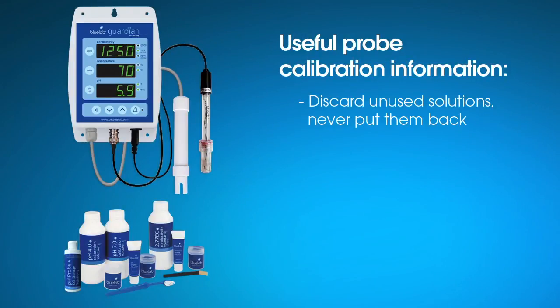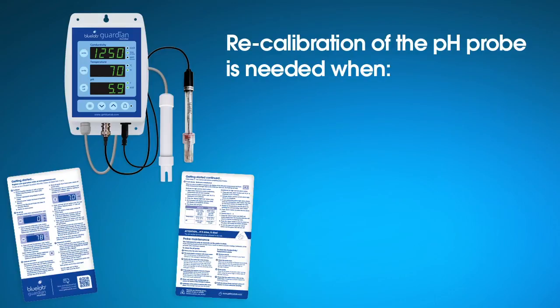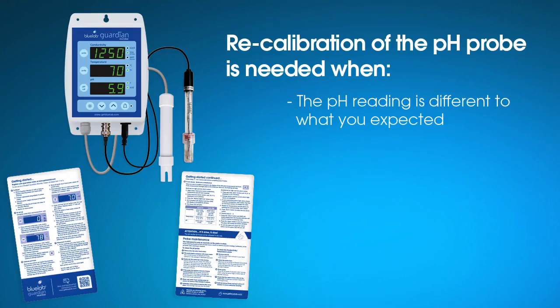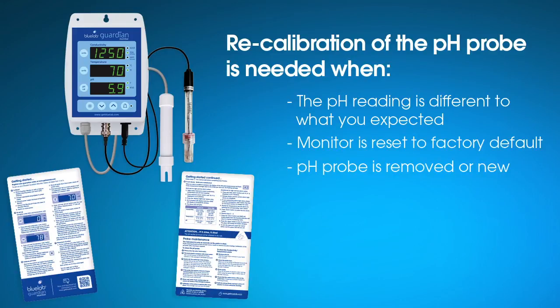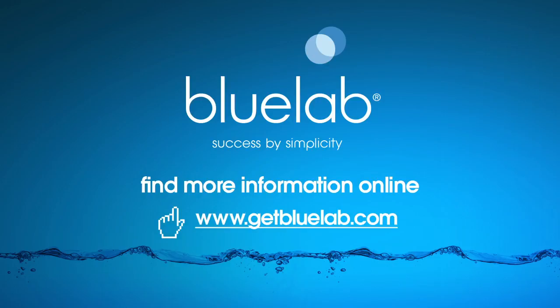Discard all used solutions — never put them back into the bottle as you will contaminate the solution. Follow the full cleaning procedures for both probes each month to ensure accurate readings. Recalibration of the pH probe may be needed when the reading is different from what you were expecting, the Guardian monitor is reset to factory default, the pH probe is replaced or disconnected, the pH calibration indicators are flashing or have disappeared, or the pH probe has been cleaned. For more tips on using Bluelab products, visit www.getbluelab.com.